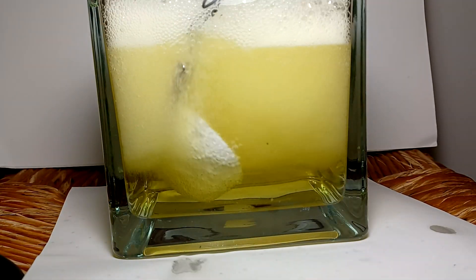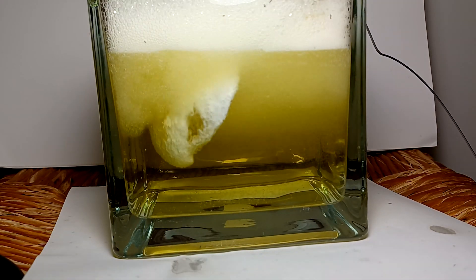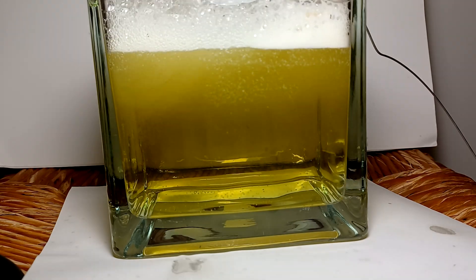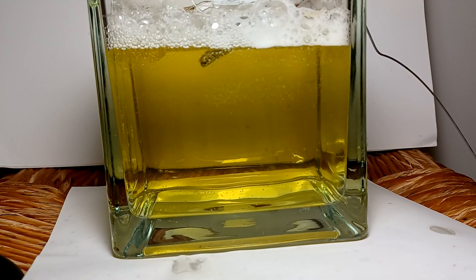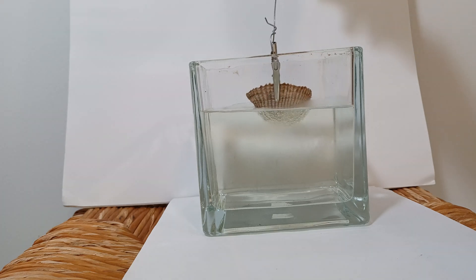This first shell was able to dissolve quite quickly. I think that's because of how thin it was and how there wasn't any sort of exterior coating on it, like the one in this next clip.